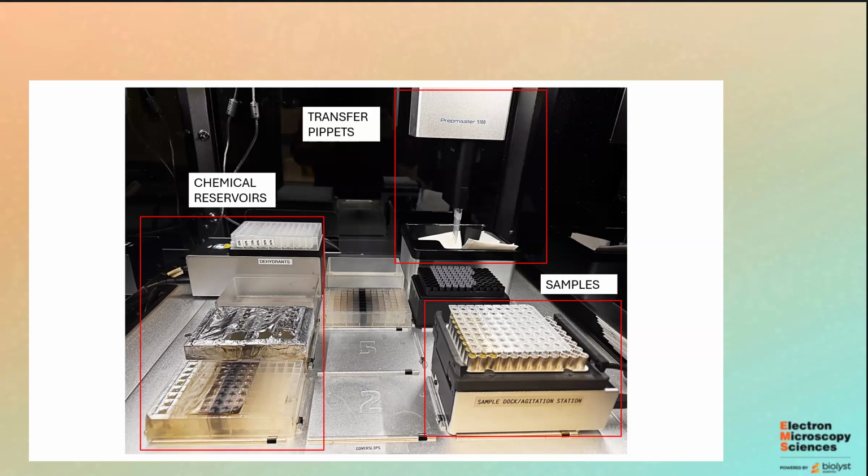Hello. Is there any vacuum desiccator in this machine? I'm sorry? Vacuum desiccators. He's asking if there's vacuum desiccation capability. So can you put a sample under vacuum on the machine? I don't know. That would probably be a question for Tom if he wants to chime in. It's nothing that I do in the lab here. No, we don't have anything off the shelf to do vacuum on the machine. We could perhaps build something custom.